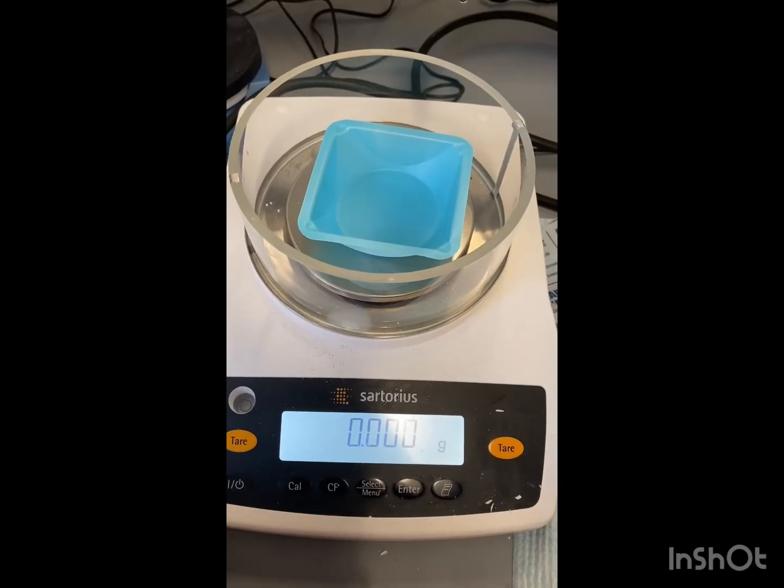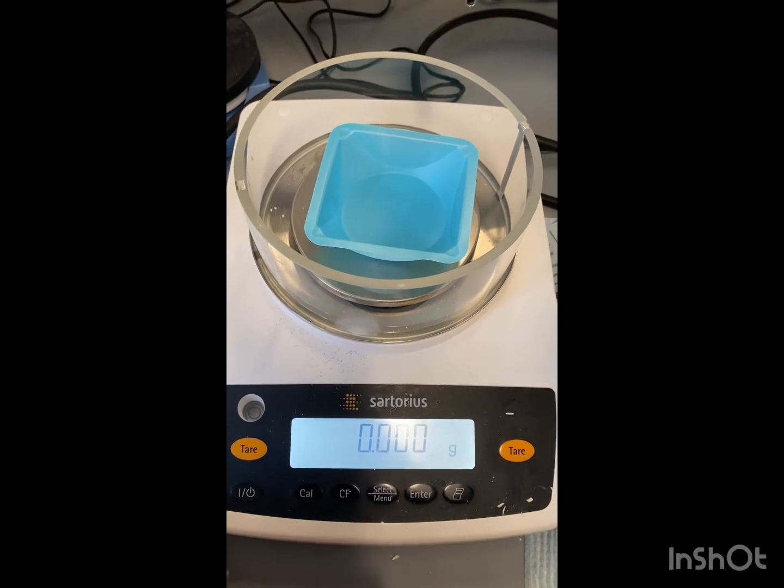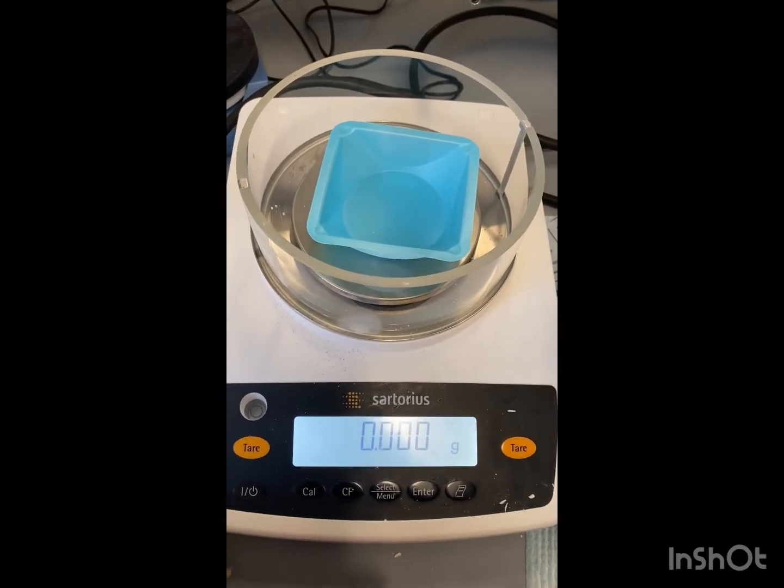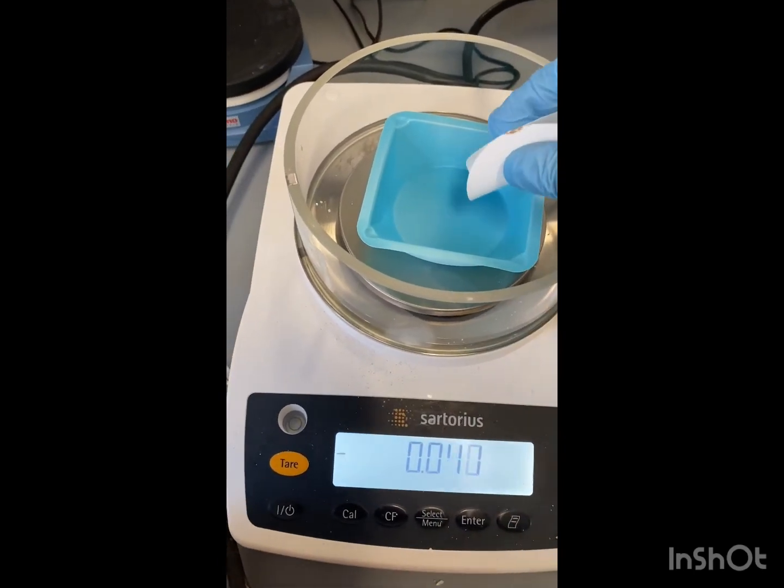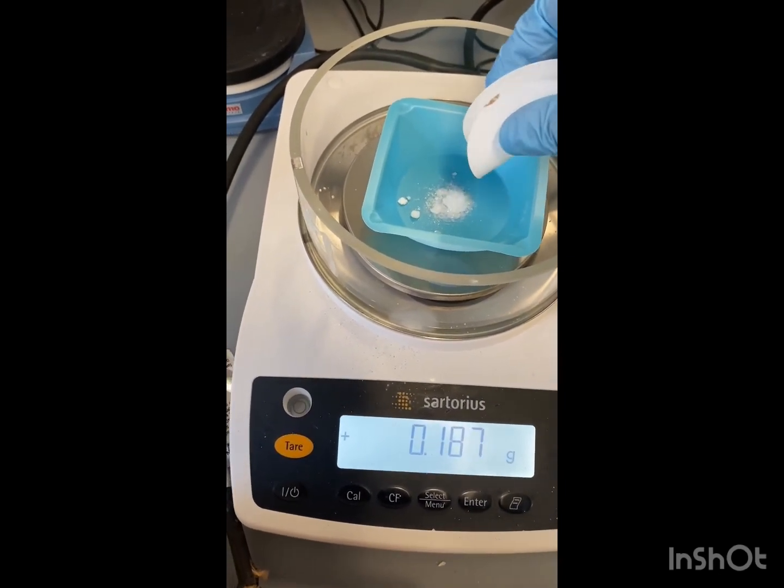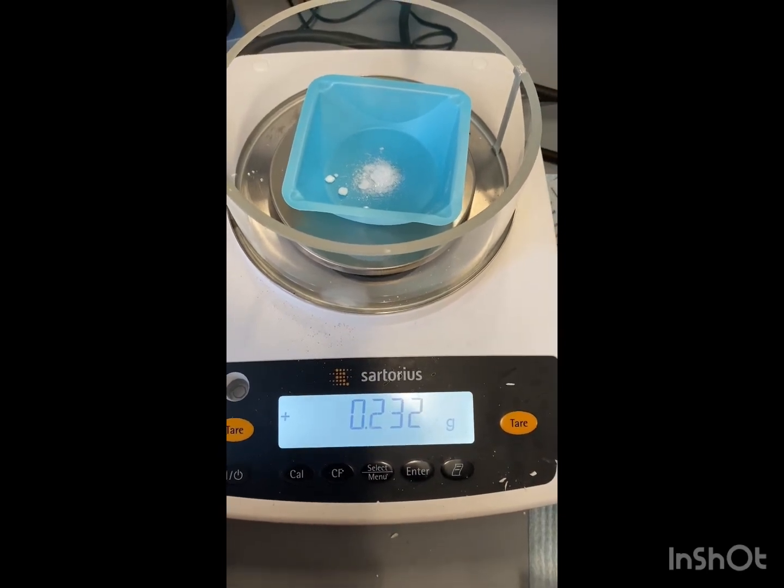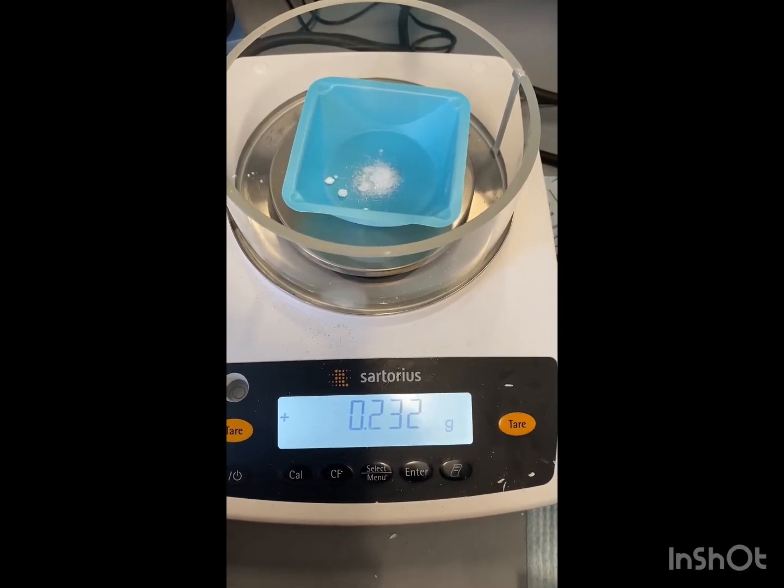So we've let our benzoic acid dry. I have a weigh boat that's already been tared. Now we're just going to get a final mass on our benzoic acid. So we have a mass of 0.232 grams.